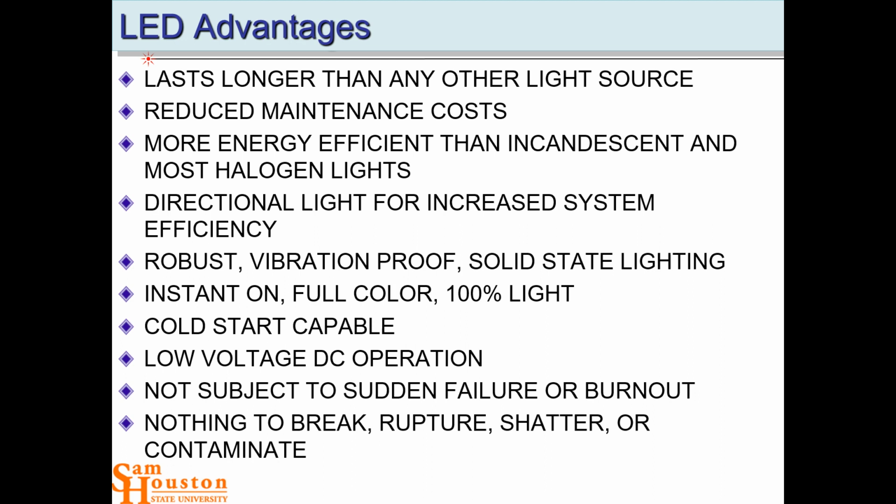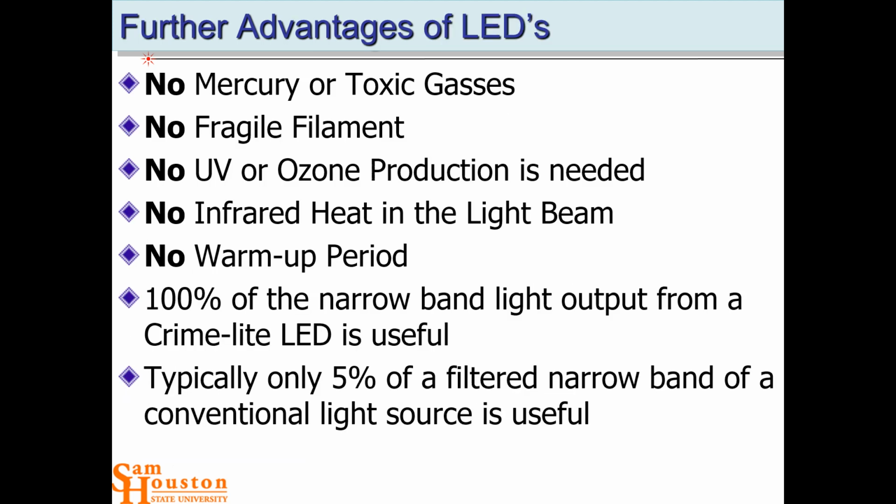I mean, you don't want to stare right into the light bulb, but the point is you can still look at your lane with this blue light shining in your face, but the yellow blocks those deep blue wavelengths, and your body doesn't respond by making you squint. So you can keep your eyes wide open and look at your lane. So if I'm ever tired and driving at night, I've got some of these in my glove box, just some yellow safety glasses. They look so cool. So then, another advantage of LEDs is they're not fragile. I think that's probably the number one thing.